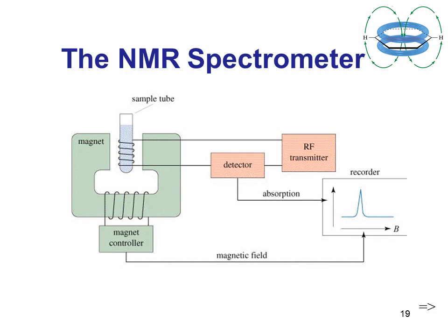This figure shows the constituents of the NMR spectrometer, which consists of different parts: a magnet, which is controlled by a magnet control, a part for the sample, and a detector and transmitter, from which we can record the differences in energy that appear as a signal.